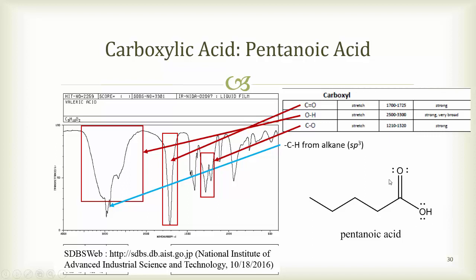There's actually some resonance structures that can be drawn that we're not going to talk about in this video, but it does affect what the alcohol looks like and where it is. Normal alcohols, as you remember, were those broad peaks right in this region. What you're going to find with the carboxylic acids is that the alcohol peak shifts over and it usually moves on top of the carbon-hydrogen stretches. And it may be kind of like this, or else it might be kind of jagged, but it will be in this region and it takes up a lot of space in the IR.